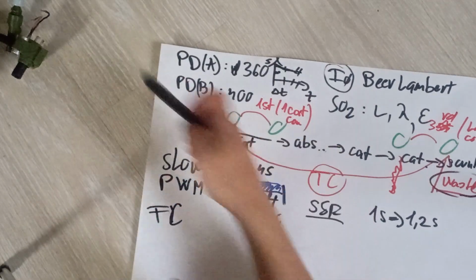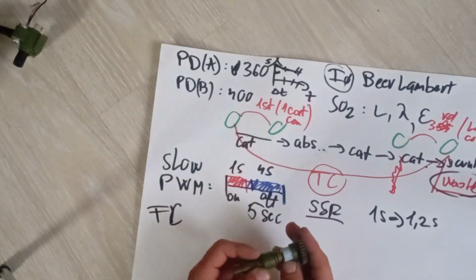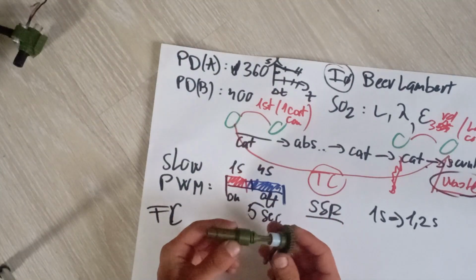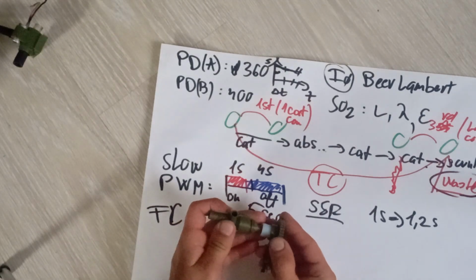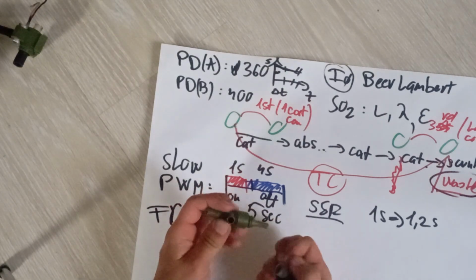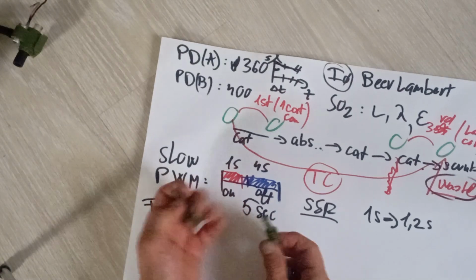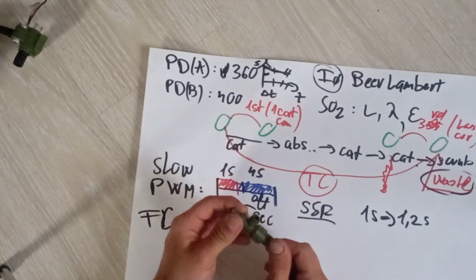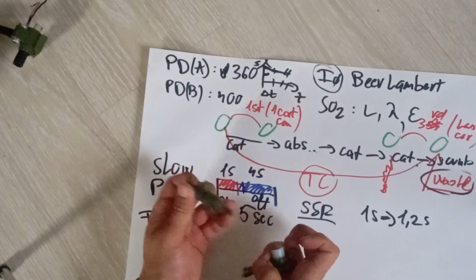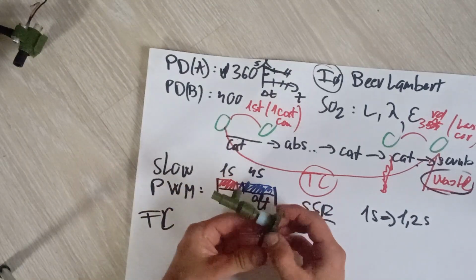If I may, just a quick demo here of the flow control. This is the system. This is like a needle valve here, and this is basically to be able to slide freely. You can't see it, but there is an O-ring here, a tubular part here, and a screw on here. There is going to be a gear, and as the gear rotates, this slides freely.